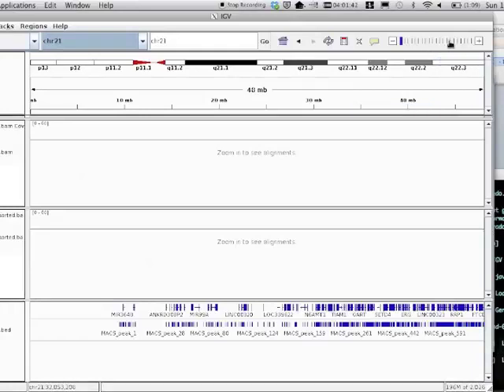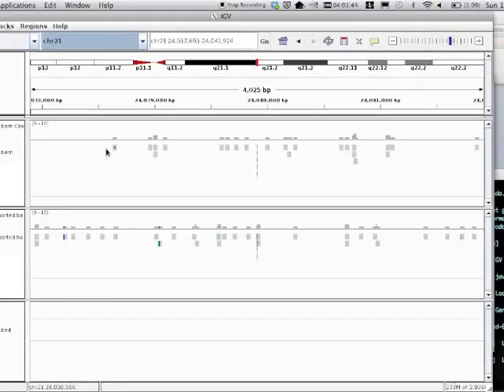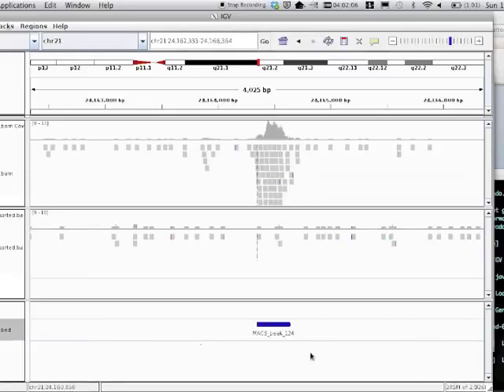Okay, and if I zoom in, so I'm looking at chromosome 21, which is where we looked at. We sampled reads just on chromosome 21. If I click this CTCF chromosome 21 peaks.bed, I can hit Control F and skip forward to somewhere where there's a feature in this file. So it's just going to skip me forward so I can see one of these peaks.